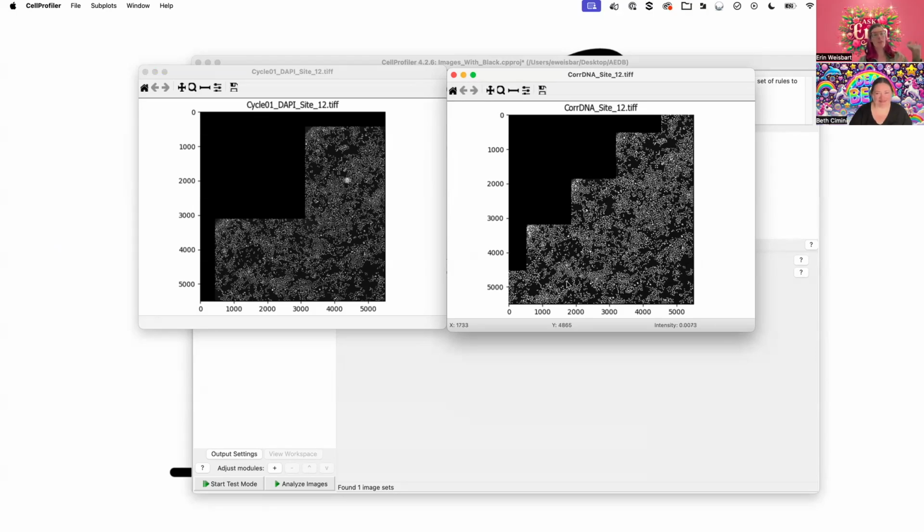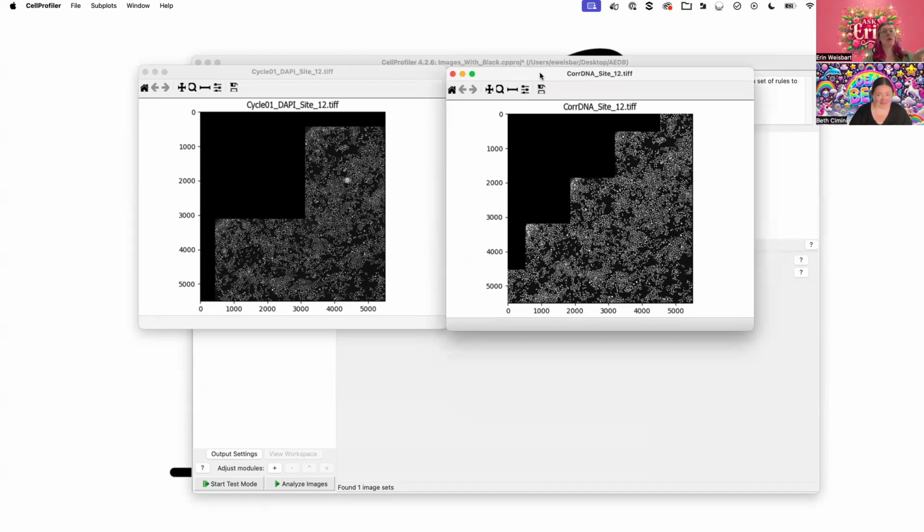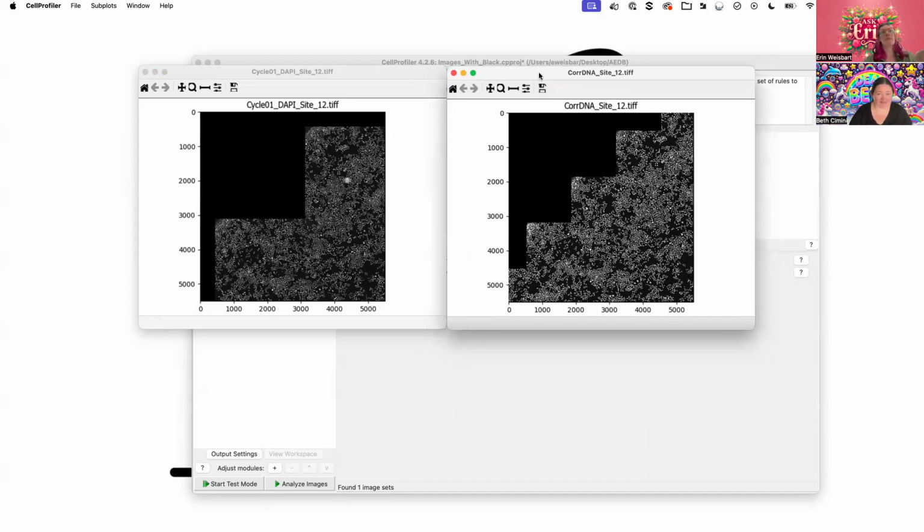So the pre-processing on this is long and complicated and not what I want to deal with. But what we are left with is, in principle, quite helpful because this could just have been happening by a mask, where if you have some idea where your physical well edge is, and you toss a mask on it, you'd still have this same starting point. So those are what we're working with as our input images.